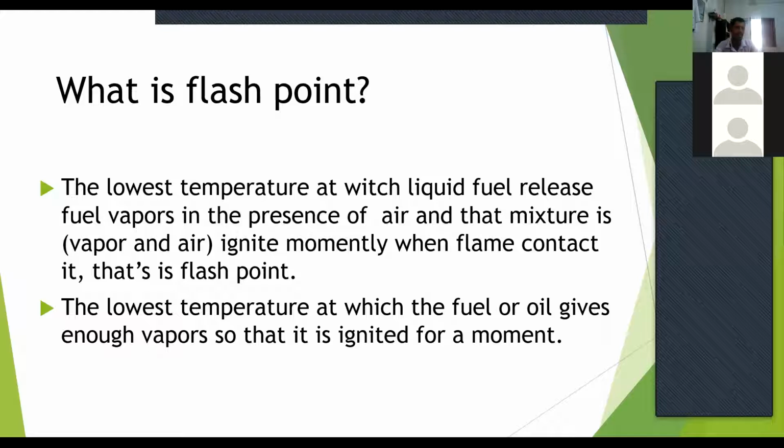That ignition is a blue flame, not a yellow flame. Within 1 second there will be a flame and a pop sound, and that's enough. Then there is no more flame. That is the flash point, and it is a very low temperature.